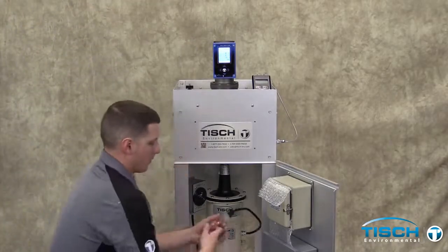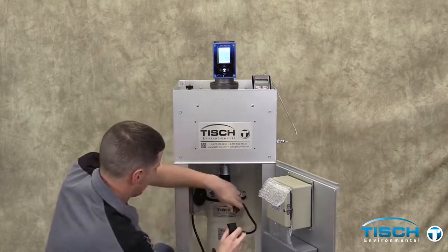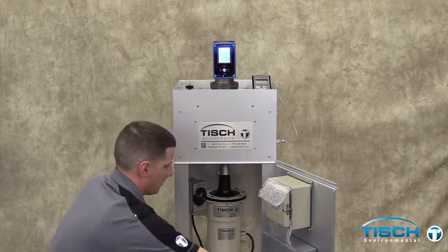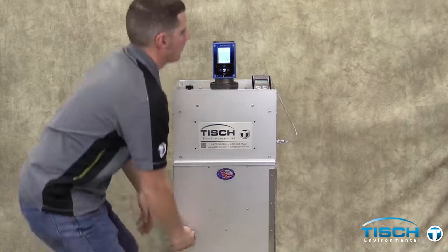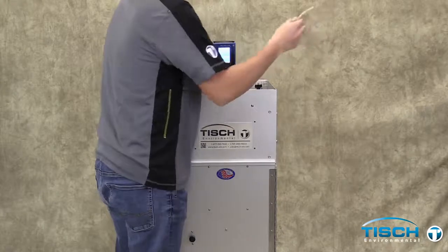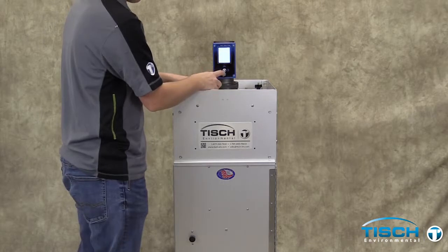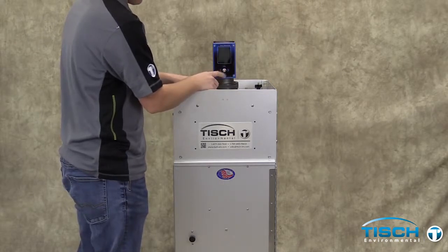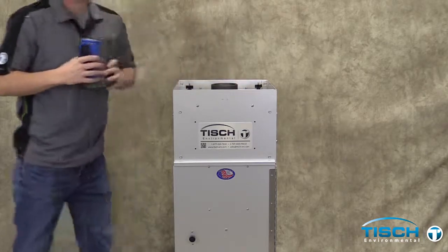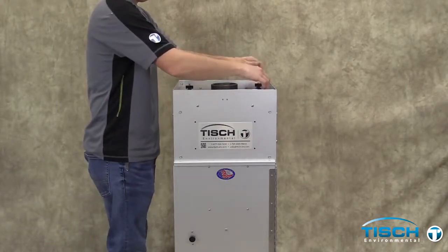Unplug the motor and reconnect the cord to the ETI and timer cord. Close the shelter door. Remove the manometer and tubing. Turn the calibrator off. Loosen and remove the calibrator from the adapter plate. Loosen the four thumb nuts and remove the adapter plate.